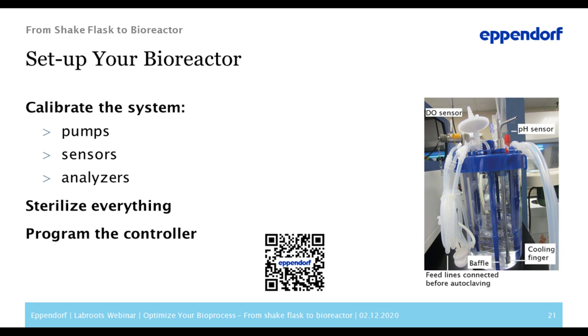Before the pre-culture can be transferred into a bioreactor, there are a few steps that need to be prepared. It's recommendable that you start these preparations in parallel to the pre-culture to optimize your workflow and save some time.